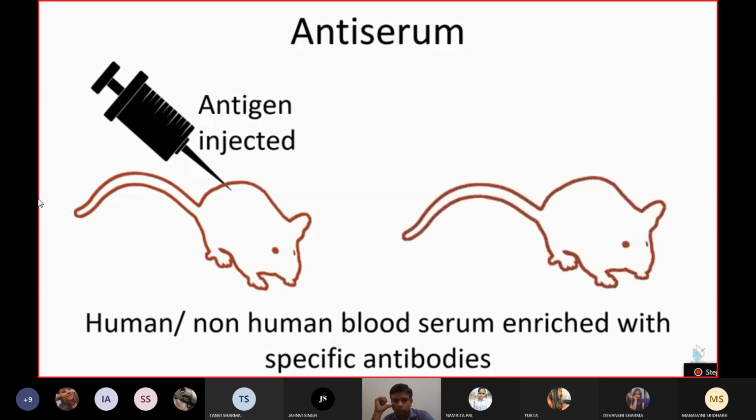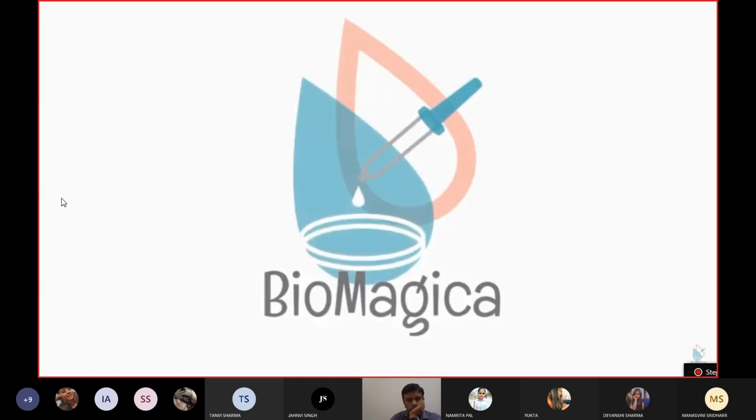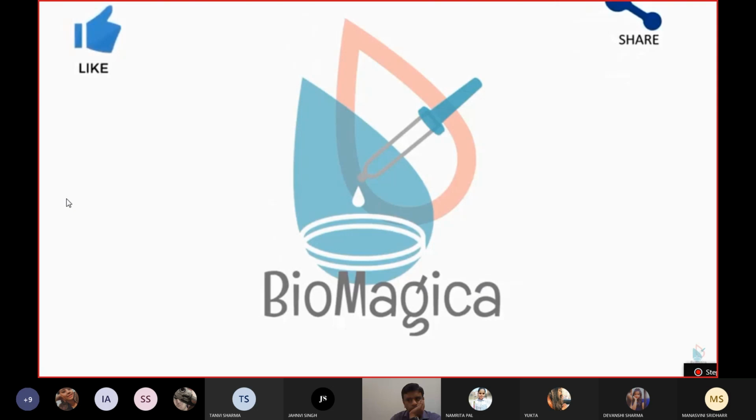The proteins mainly consist of albumins that regulate oncotic blood pressure, fibrinogen that is a clotting factor, and globulins that are antibodies. Plasma and serum both are derived from blood. Upon centrifugation of blood in the presence of anticoagulants, RBCs settle down as they are most dense, followed by a buffy coat of WBCs, followed by plasma, which is the least dense. Since anticoagulants are used, the supernatant contains clotting factors like fibrinogen.